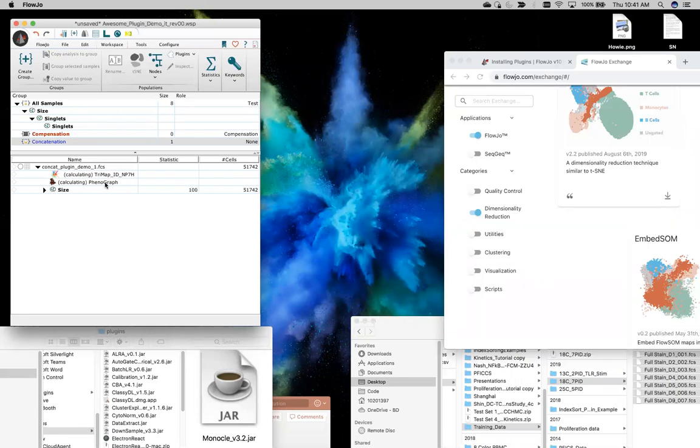This includes the extra step of installing R tools on Windows or Xcode on Mac. So you need either Xcode or R tools present, depending on your OS, and then Phenograph should run quite well. And like I mentioned before, the clustering that Phenograph generates is actually quite robust, and so I like using Phenograph partly for that reason.